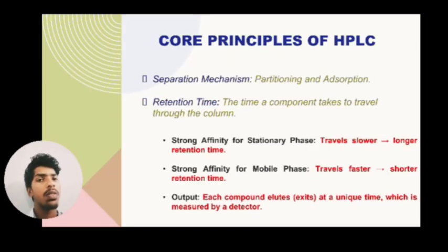Core principles of HPLC. Let's know what the core principles of HPLC are. The separation mechanism is partitioning and adsorption.